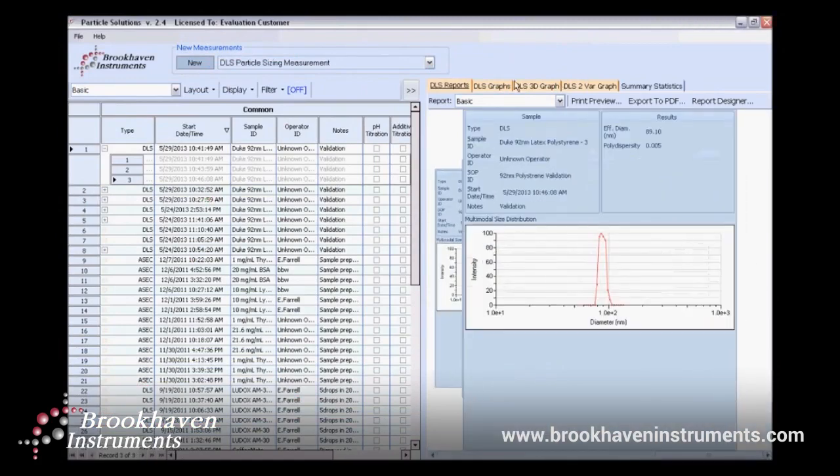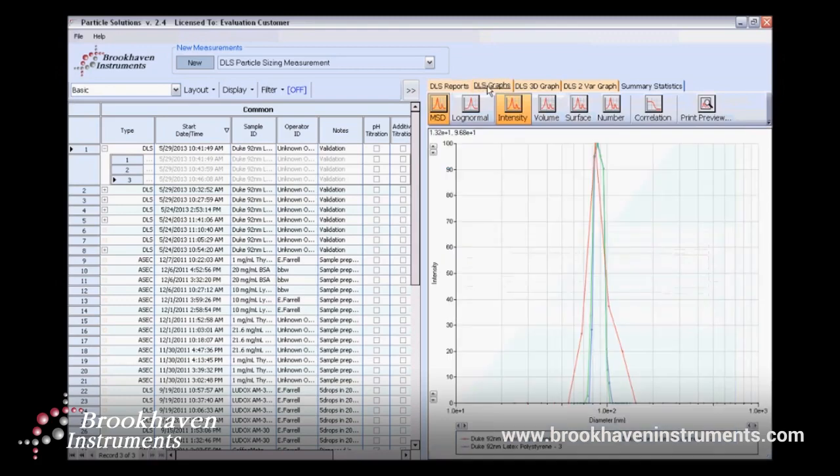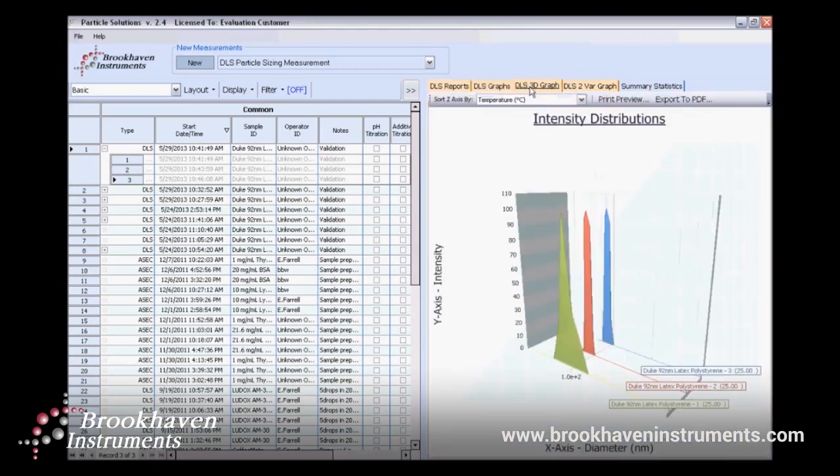Once the instrument has completed its run, all the data will be added to the Particle Solutions database.